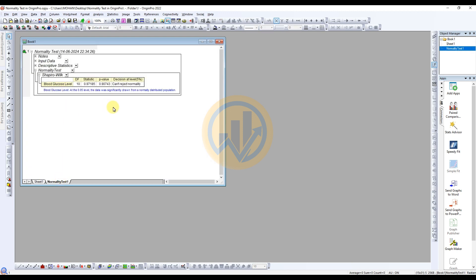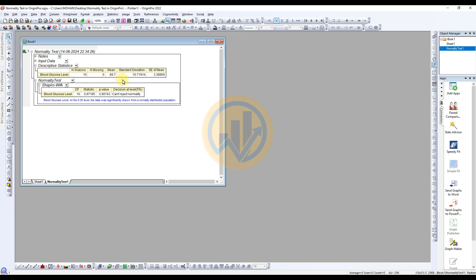The normality test is now calculated. The first section shows the descriptive statistics. Click the plus sign to open the table for the descriptive statistics. We will first read the data, and in the next section we will cover how to convert the table to publication format and how to interpret it. The number of observations for the blood glucose level is 10, with no missing values.